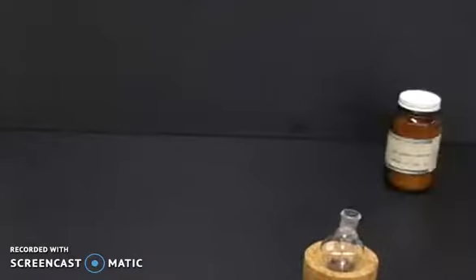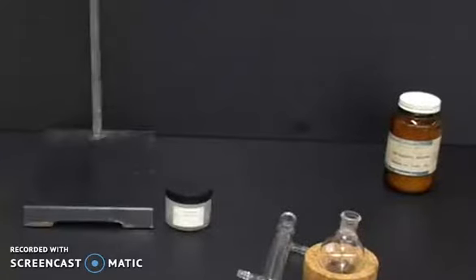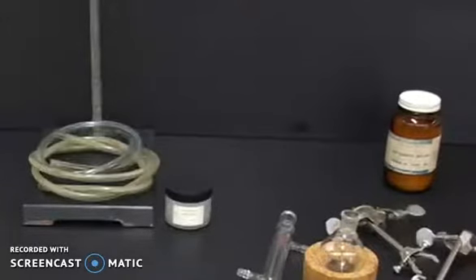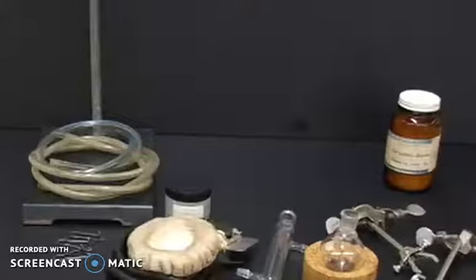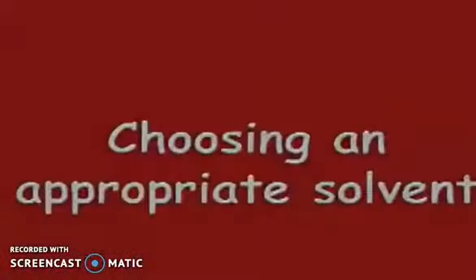To carry out a reflux you need a round bottom flask, a stir plate and stir bar, boiling stones, a condenser, grease, two extension clamps, two pieces of thin-walled rubber tubing, three hose clamps, a heating mantle, and iron rings.